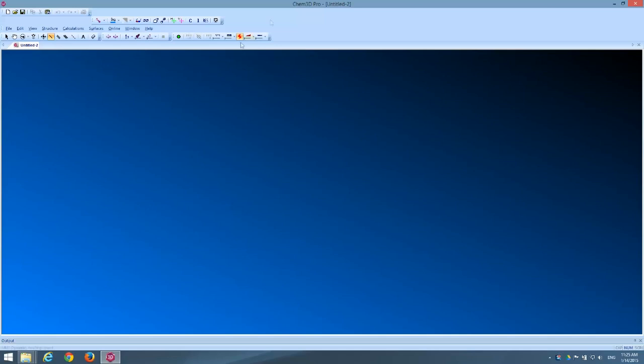I've already opened Chem3D from the ChemBioOffice suite. Sometimes when you open it you'll have a ChemDraw editor already open and other times you may not. I've deliberately closed mine here so I can show you how to get it back if you don't see it.